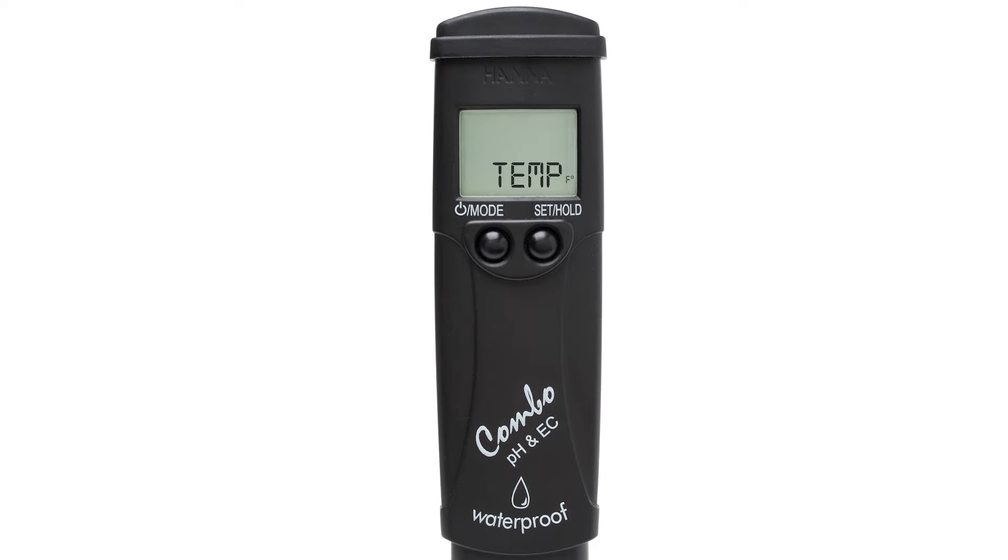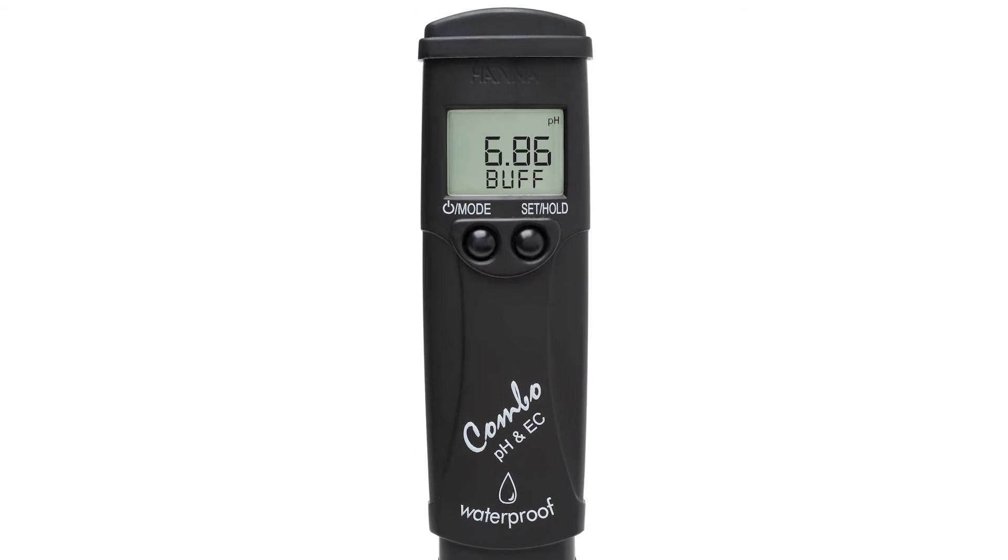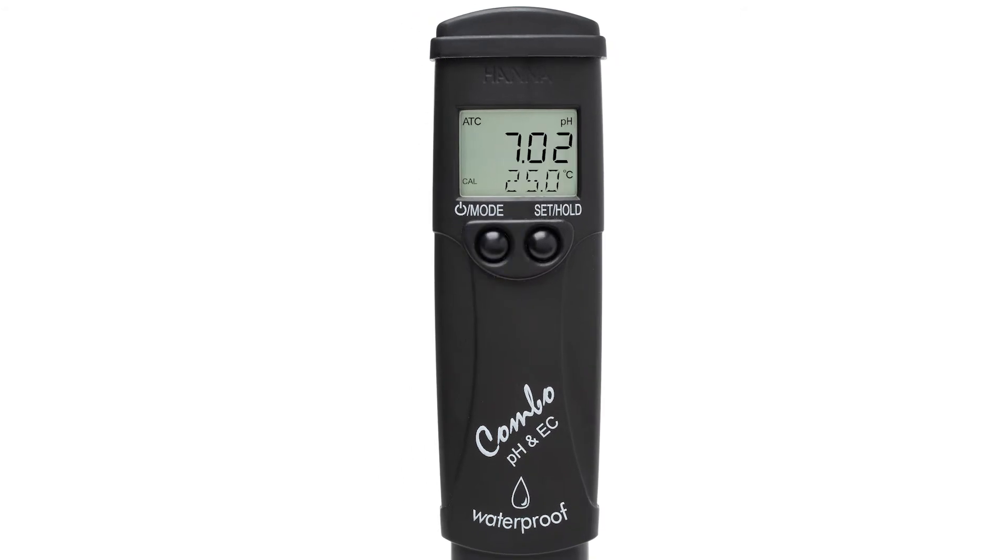Once you have your preferred setting, pressing the MODE button again will allow you to change your calibration set. These testers use two sets of standard pH buffers. Depending on your application, you may use the pH 7.01 buffer set — with 4.01, 7.01, and 10.01 buffers — or the NIST buffer set, with pH 4.01, 6.86, and 9.18 buffers. You can press SET HOLD to switch between these two sets. Pressing MODE again takes you back to measurement mode.